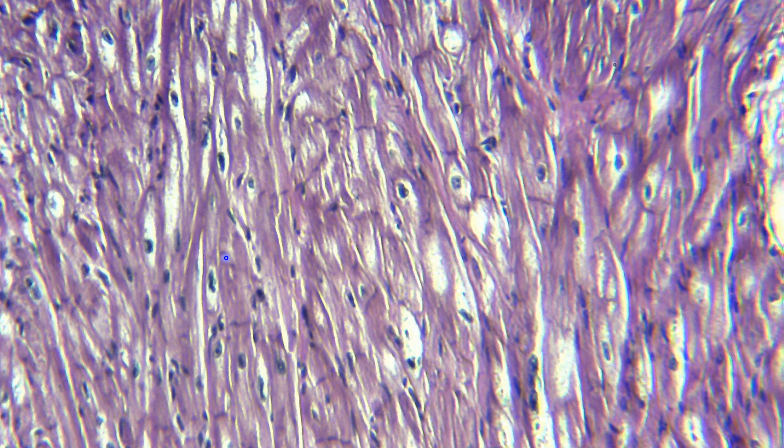If you still feel like this resembles fibrocartilage, my advice would be to get multiple examples of fibrocartilage and multiple examples of cardiac, and put them side by side — like in an album or a Word document. You should be able to tell the difference, but the key is to learn how to scan the slides very carefully. Look for those side-to-side dashes. If you see intercalated discs, it absolutely has to be cardiac.